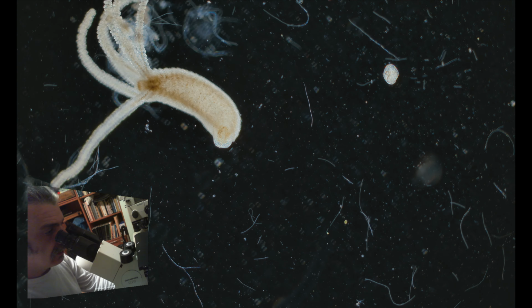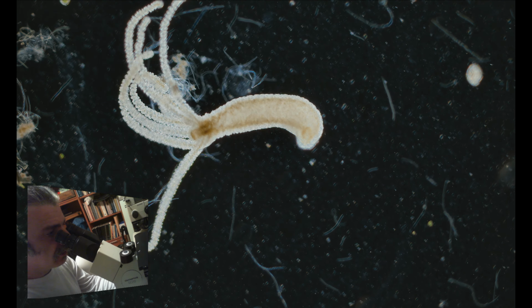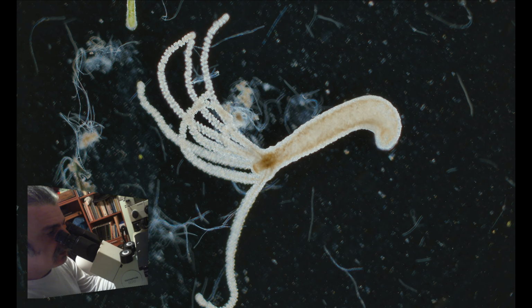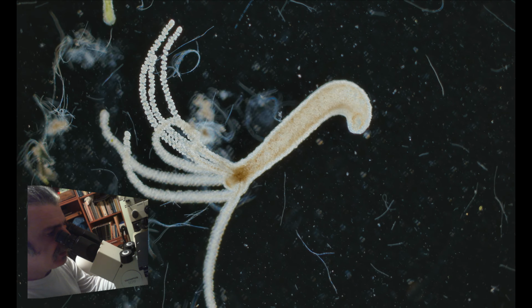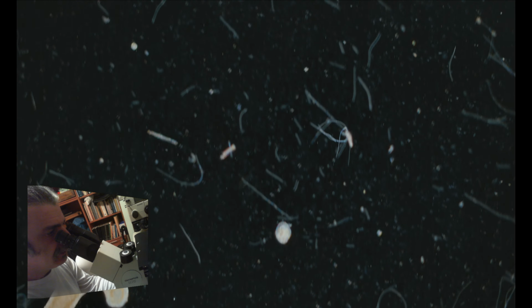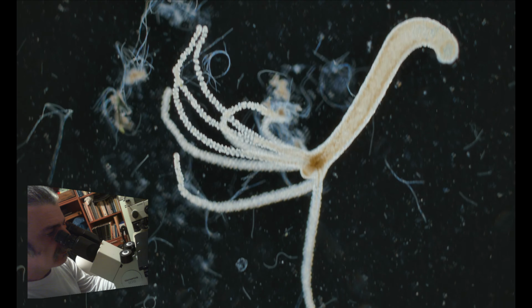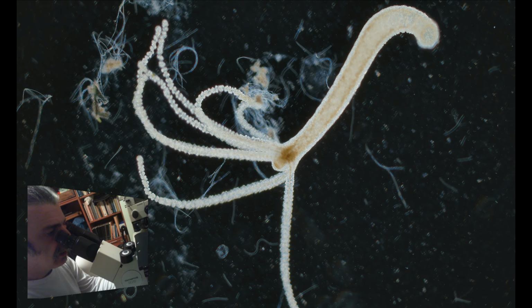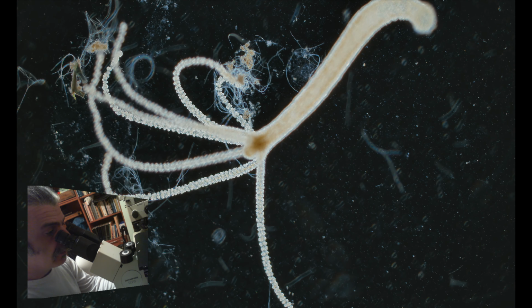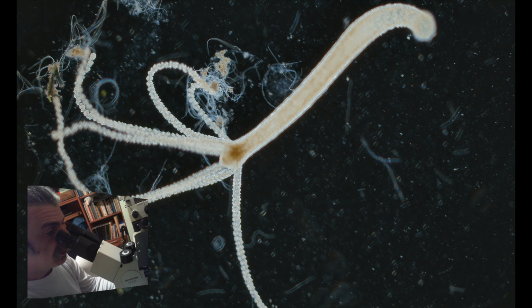We're going to do a live scanning today of a sample that I took some days ago from an urban pond in Tel Aviv. We have many urban ponds around the city, with a lot of ducks and water lilies, and they house a large diversity of microbes and other creatures. Today we're going to explore some of them.